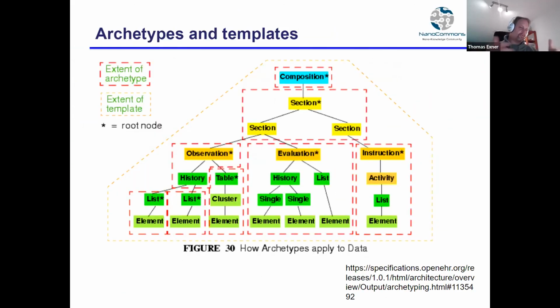This whole idea brought me to this thing of an archetype, which is something which is used in an open system for medical data. But the idea is really that you just have these things and you build these structures of combining existing other things. Yeah, that you say, okay, I have here all these red boxes are something which is already defined, and then you can build more and more complex data models out of that by just combining them together and reusing them.